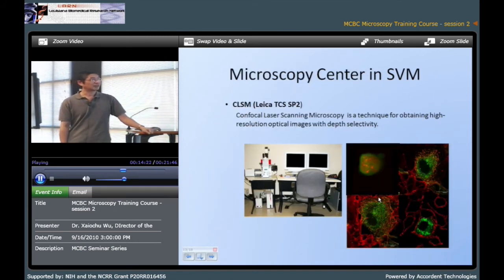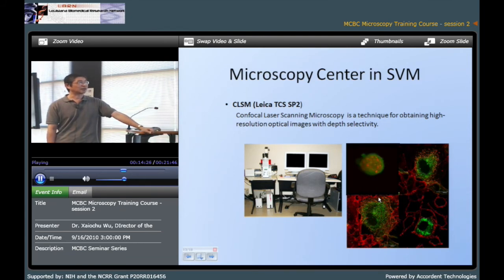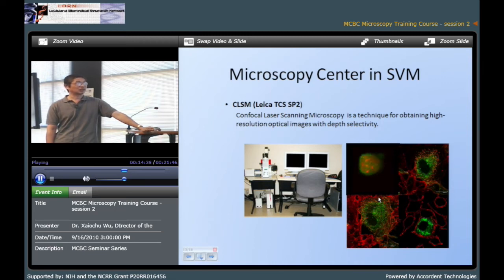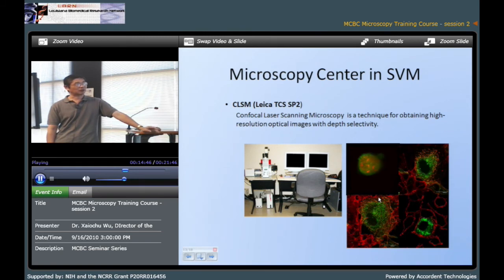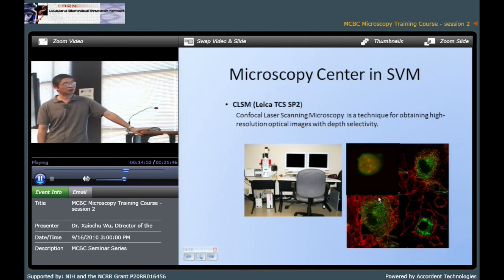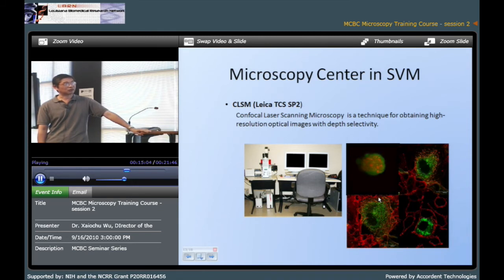This is our confocal laser scanning microscopy, which is used to get high resolution optical images at different depths. The first image is our 3D image — it is a half cell of the macrophage. The green is the membrane and the red is the bacteria. So using this microscopy you can see the distribution of bacteria in the macrophage. The other three pictures are also biological cells, double-stained with green and red. You can see yellow in some parts, which is the co-localization position.